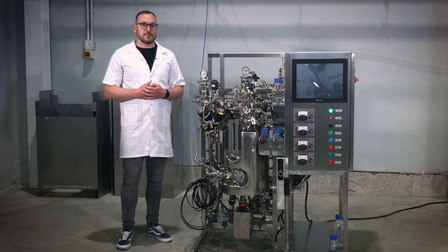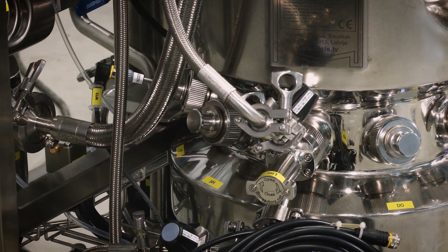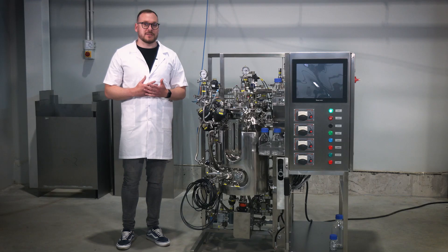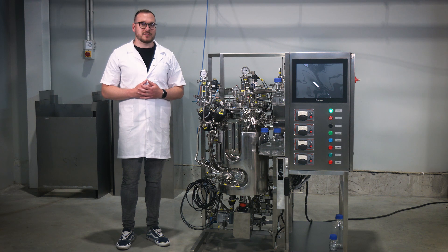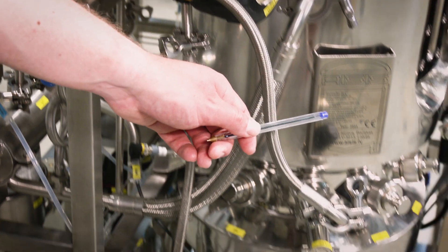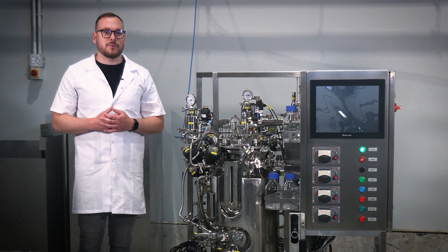Step 9. Using the supplied hoses and tri-clamp connections, connect the steam supply for the sampling port. Ensure a secure and leak-free connection. Step 10. Using the supplied hoses and tri-clamp connections, connect the condensate discharge from the sampling port to the technological skid. Double check for proper attachment.